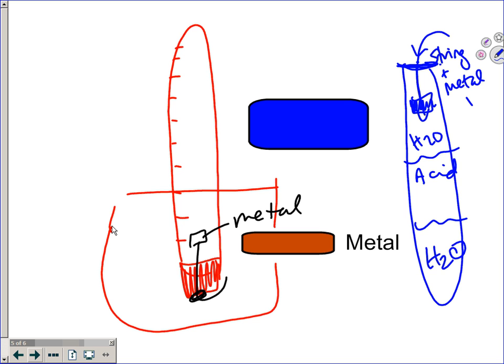Okay, and the good thing is this acid's 3 molar. It's pretty dense. It's going to sink to the bottom. It won't be close to your hand at all. But what we have to do very quickly is put our thumb on the bottom of the one-hole stopper, because the stopper will be here, and there's our one hole up here. So you'll put your thumb on the one-hole stopper and you'll flip it upside down real fast into your beaker.